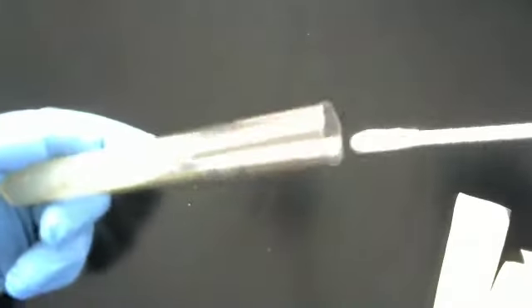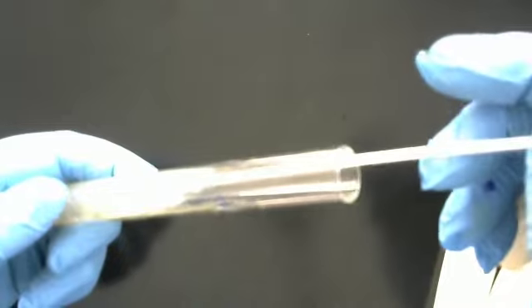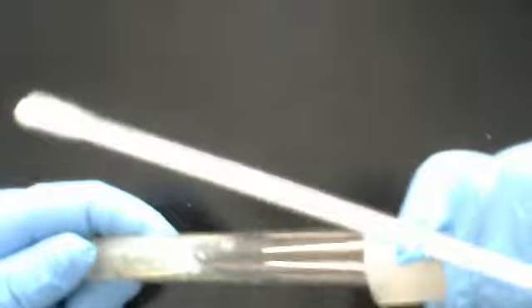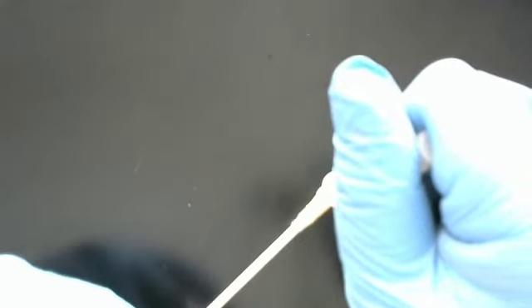Once again, this is Citrobacter freundii. And let 5 seconds go by to make sure that it's not a false positive, and that's also a negative.